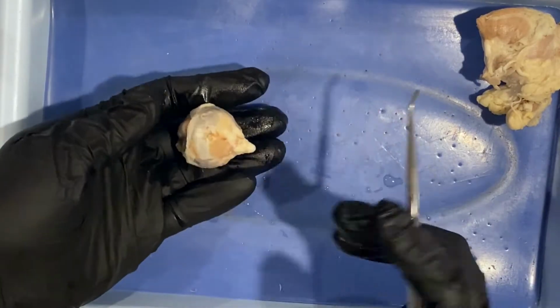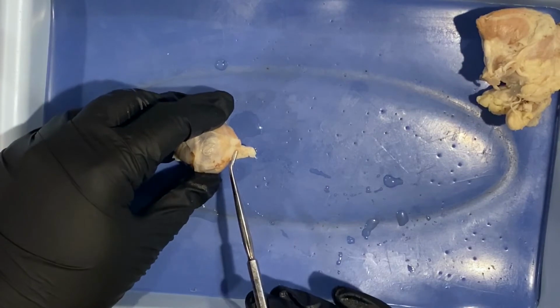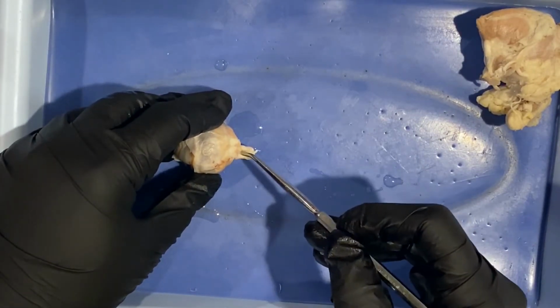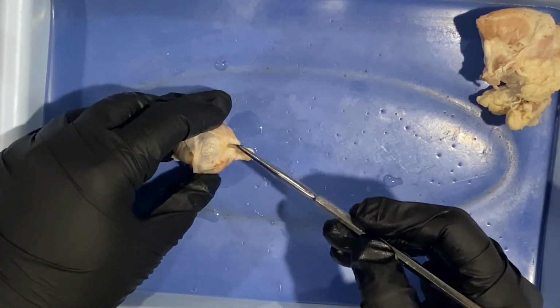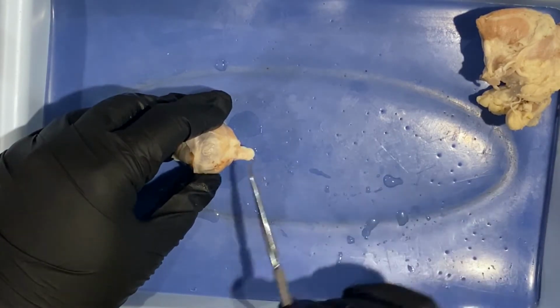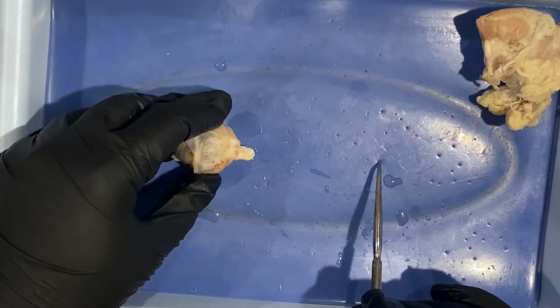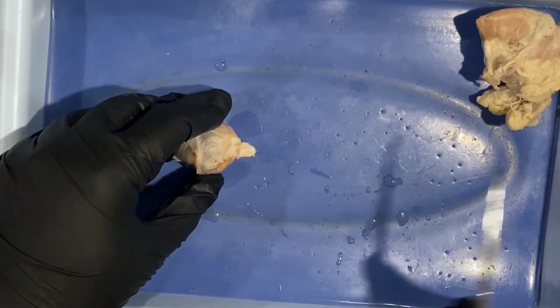So the other structure we can see externally is the optic nerve that is coming off the posterior portion of the eye. This nerve is cranial nerve number 2, and it is taking the axons from the photoreceptors to the visual processing center in the brain, which includes the corpora quadrigemina, that superior colliculi we learned about in the sheep brain dissection. That's where the visual reflexes are processed.